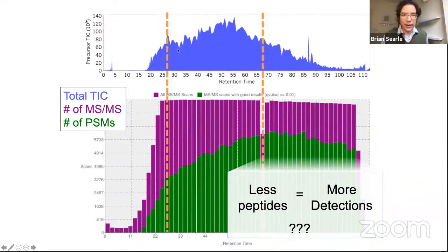And so what's going on here? Actually, what we're seeing is a circumstance where the measurements we're making aren't actually of individual peptides. We are collecting MSMS spectra that contain multiple peptides at the same time. Because of that, it makes it very difficult to make detections from those peptides. This is just because when you have more and more peptides, the space that you're able to sample gets more and more congested. And so when you select out a particular mass for MSMS, oftentimes there can be other peptides at those same points.